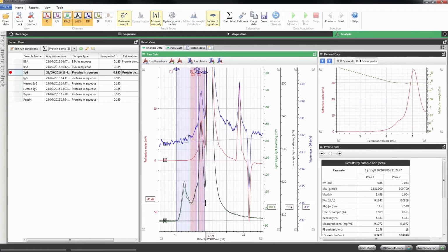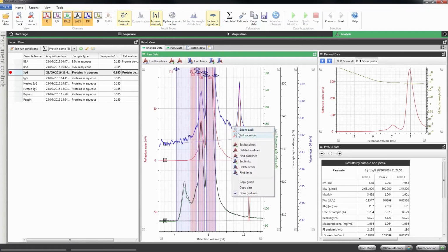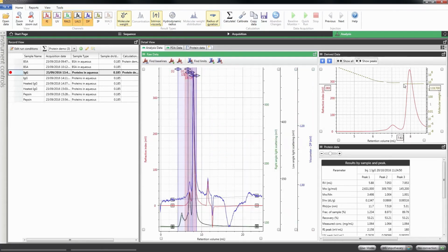Then the second peak. Then the third peak. And again, in our molecular weights, two really nice monodispersed stable populations, and then the aggregates more varied in their molecular weight and higher up. So you can see I've got about 145, 150 kilodaltons for the IgG monomer, 300 kilodaltons immediately identifies the other one as a dimer, making up about 90 and 9% of the sample, respectively.